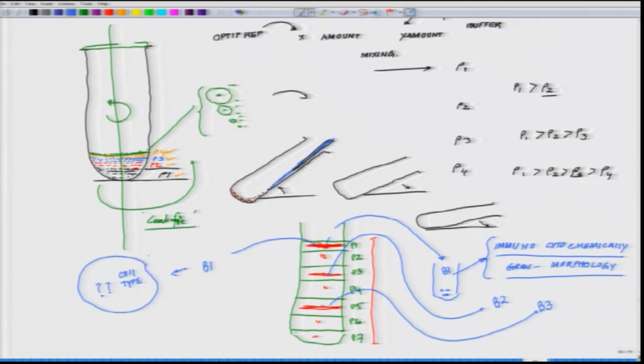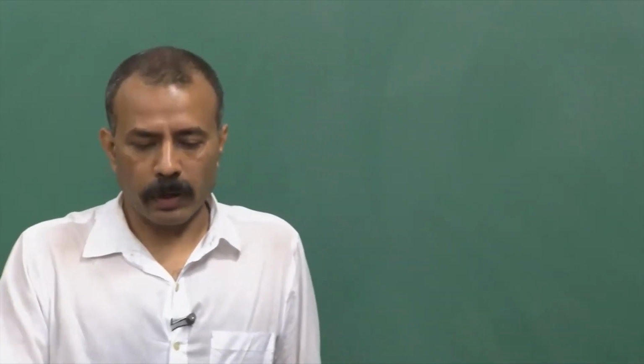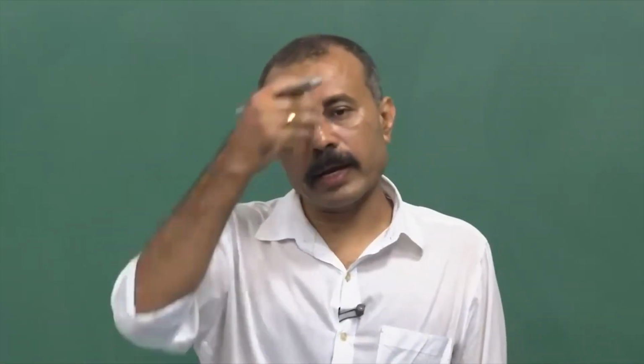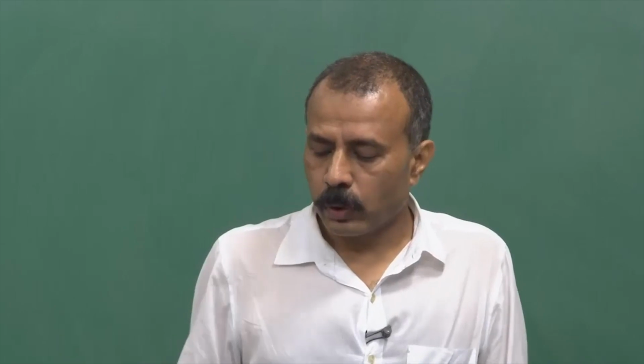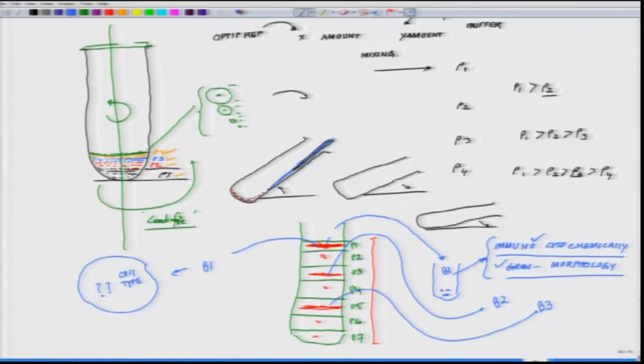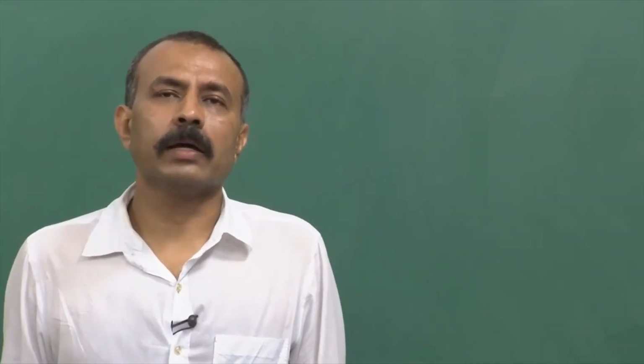So, these are some of the technologies which have been achieved over the years, like the very first technology. After the hippocampal neuron, I'll come to the spinal cord neuron, where you have to separate out the oligodendrocytes and several other cell types. I'll come to that. Okay. What I wanted to highlight here is that these are the basic technologies and the follow-up technologies one has to master before you achieve the goal of developing the defined systems.